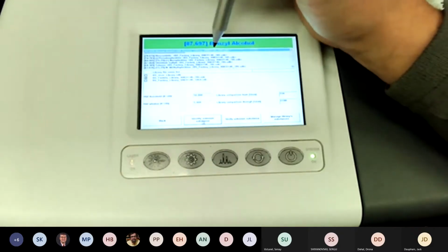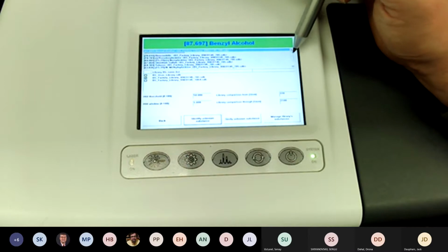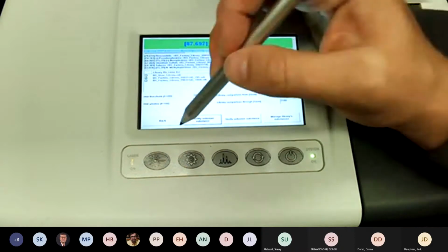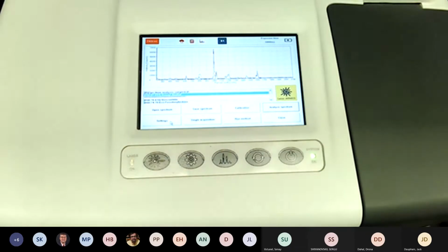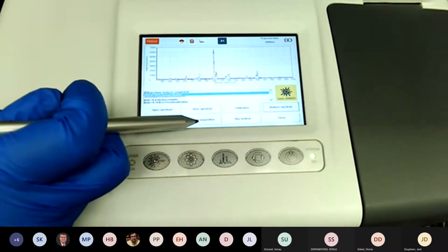Why is it? I'm not sure. One more time, the acquisition. Yeah, try one more time. Okay, let's try one more time.